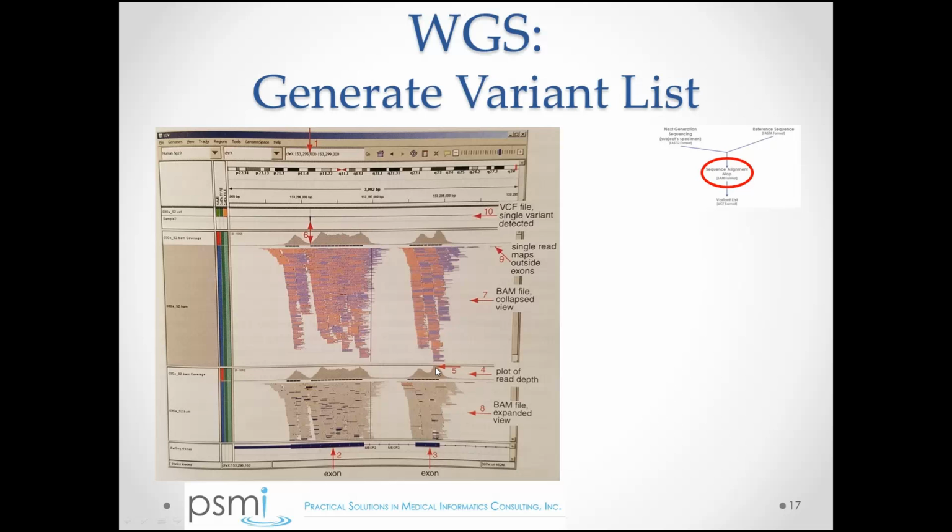And as you might guess, and I'm not going to get into it quantitatively, but at least qualitatively, where you have a lot of reads, you probably can call the base at a particular spot with greater confidence, right? Because if you have 1,000 reads, and even if one or two of those bases differs, if 999 of those bases say one thing and one base says something else, you're probably pretty sure what that base is.